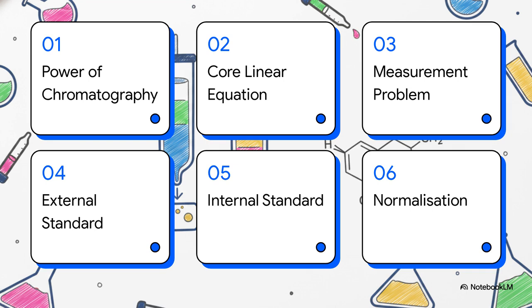Here's our roadmap for the day. We'll hit the power of chromatography, dive into the core linear equation, and look at the measurement problem. Then we'll break down 3 methods to solve it: external standard, internal standard, and normalization.